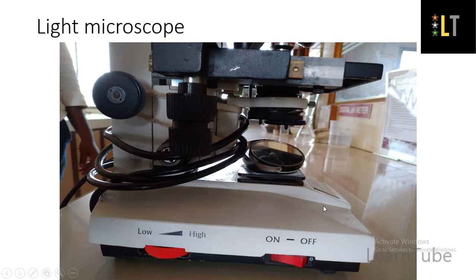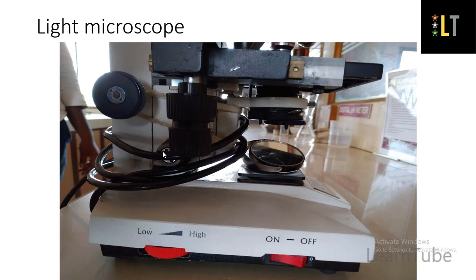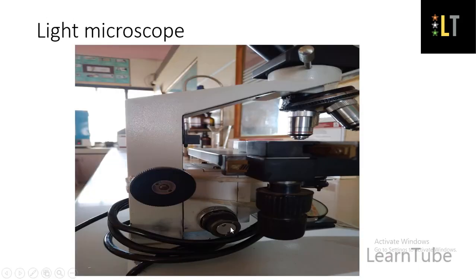This is the stage of the microscope. Here are the two knobs used for adjustment of the stage, called the stage adjustment knobs. By moving them, you can move the stage either right to left or forward or backward. The coarse adjustment knob adjusts the height of the stage from the objective lens, and the fine adjustment knob is used for adjustment of a blurred image.